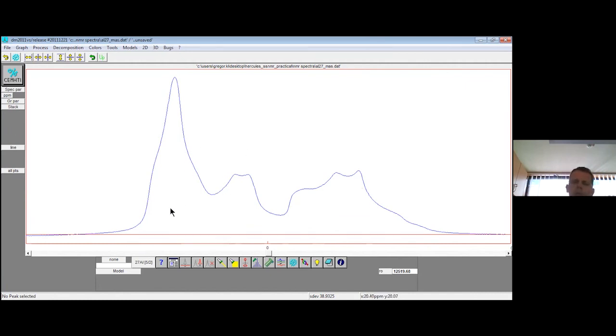And this is that this nucleus has spin 5/2, so it's spin larger than 1/2, which means that it has a quadrupole moment. So transition frequencies are affected also by quadrupolar, electric quadrupole interaction, by quadrupolar coupling, what we call it, yeah? By that second term, so by electric field. And this interaction is very strong often, if electric quadrupole moment is strong, and if the environment is relatively asymmetric, then this interaction can be very strong.